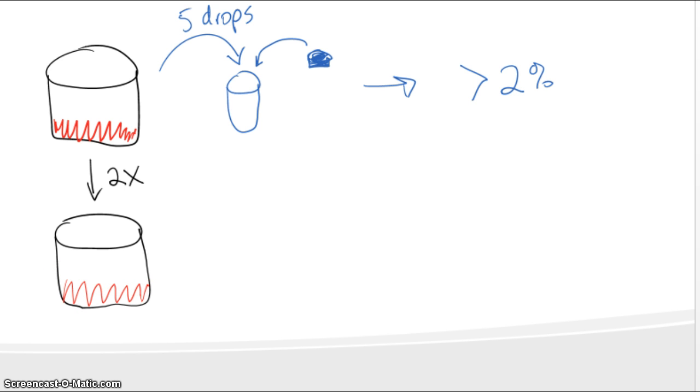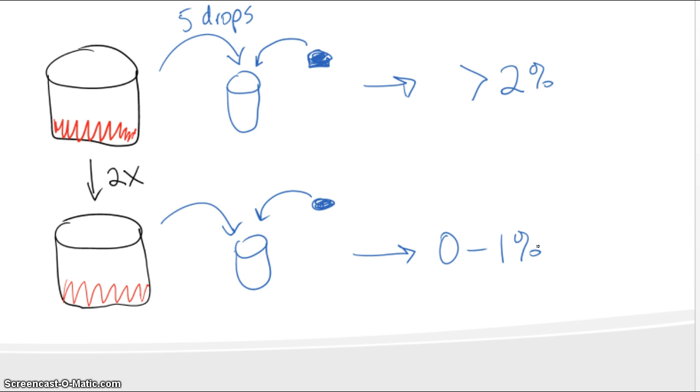And we did the same thing: we put our 5 drops into the test tube, we added our tablet, and we got a nice color. And hopefully now our color was somewhere between 0 and 1%. So we were on the scale of the Clinitest assay, and we could tell exactly, or at least reasonably close, what our sugar percent was, okay?